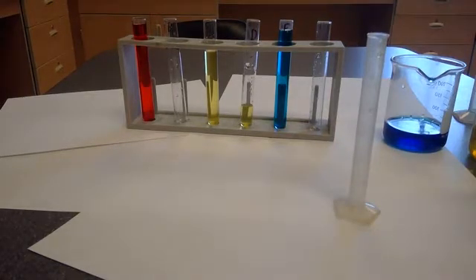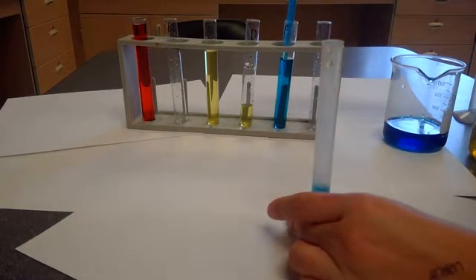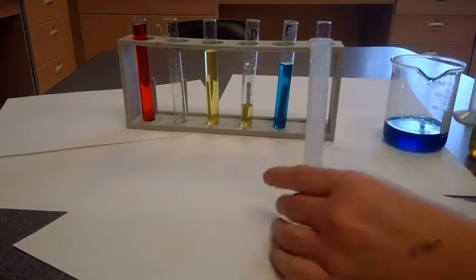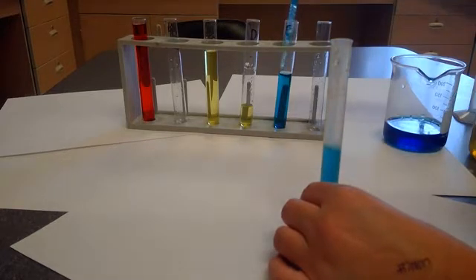Now I'm going to take from test tube E, I'm going to take 7 milliliters and I'm going to put that into test tube D where they will then mix. So again, I'm going to use this graduated cylinder and I need 7 milliliters. So I know from the video it's difficult to read. These large ones are multiples of 2, so there's 2, 4, 6, so I need to go right in the center, and there's a line that's just a little bit longer than the others, so I'm currently at 6.